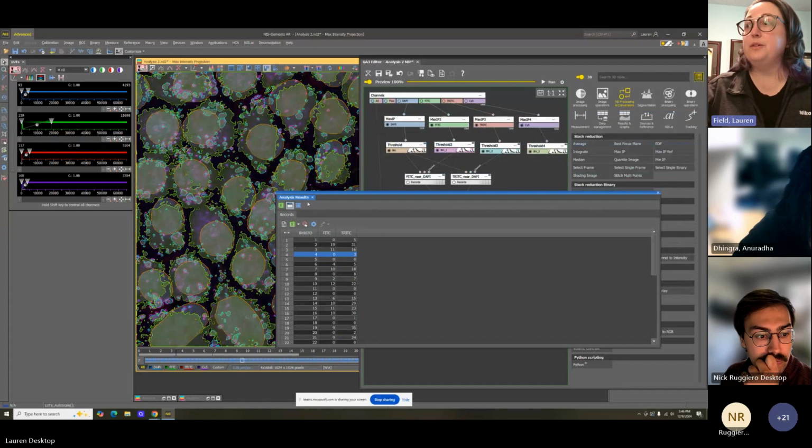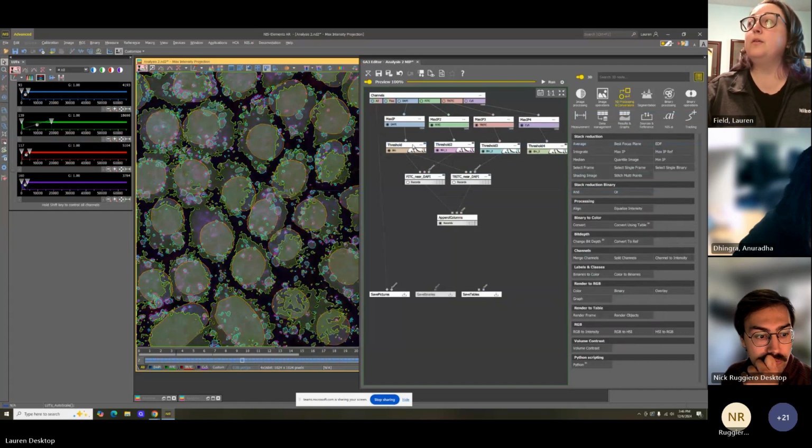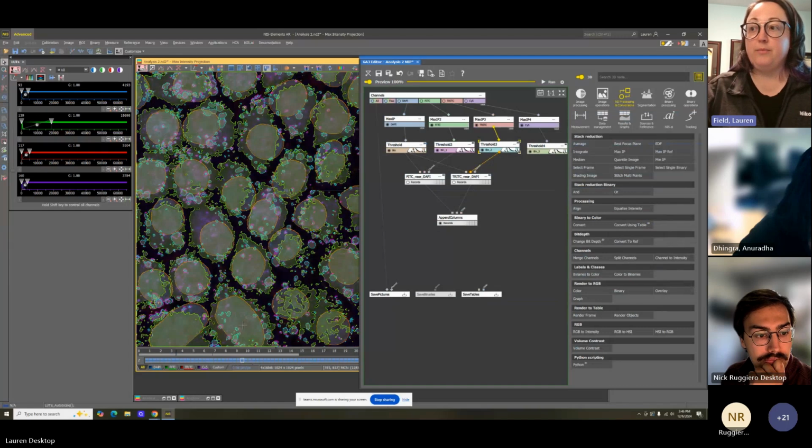For this type of build, you're just essentially copying things over, individually thresholding, and then getting a saved table out from this analysis. Most of these thresholds were just very simply done on the intensity. I didn't do any pre-processing or anything like that.